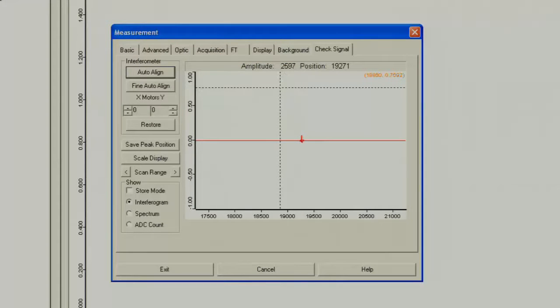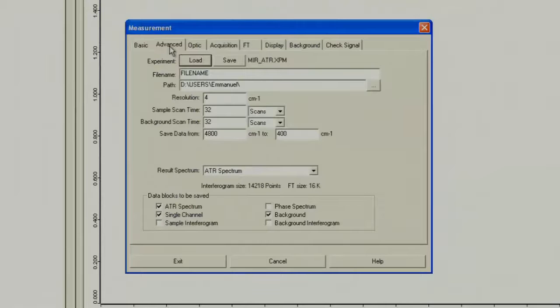If the intensity had been about 2300 or less, you would have wanted to contact the staff for help. At this point, you want to do the background scan, located in the advanced tab.